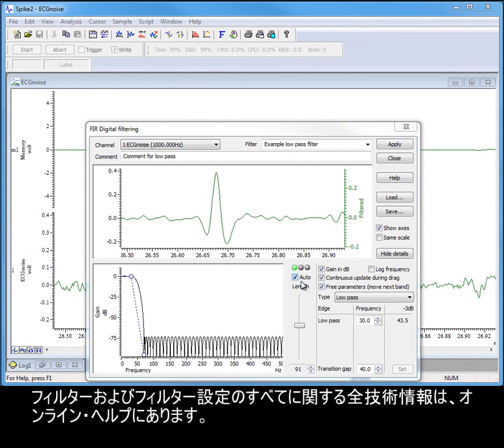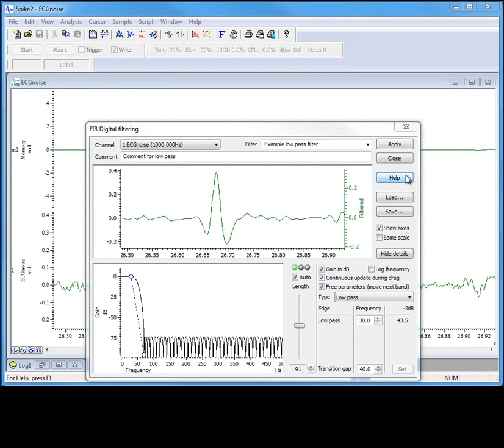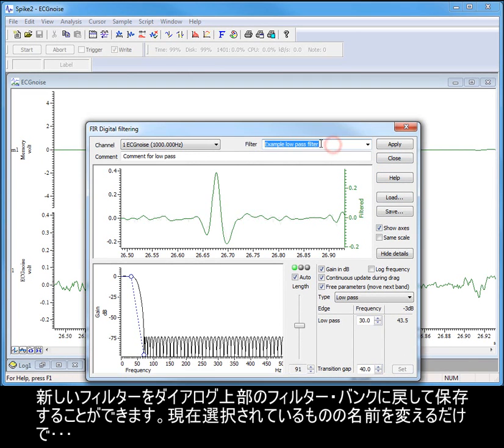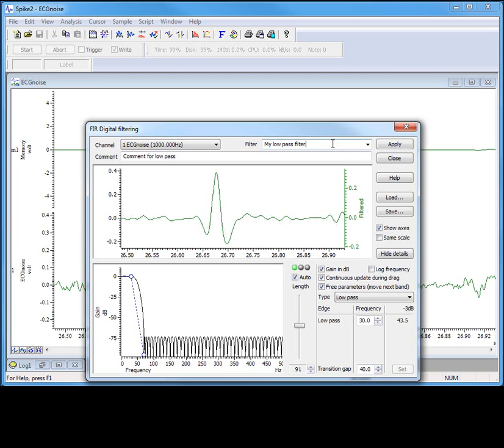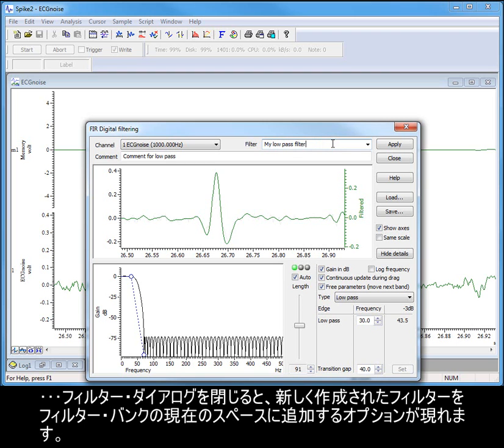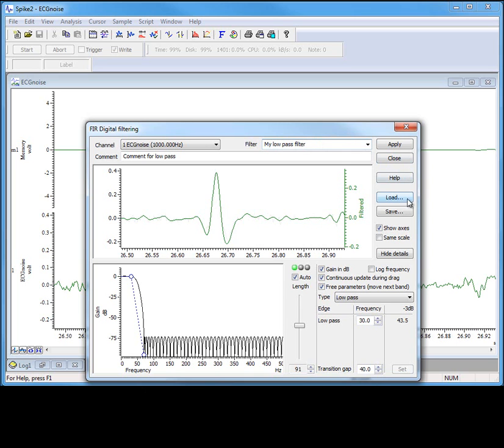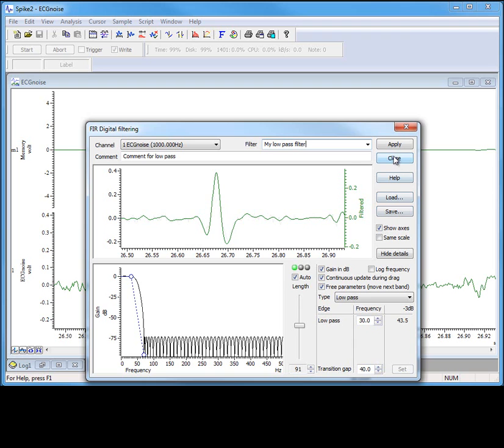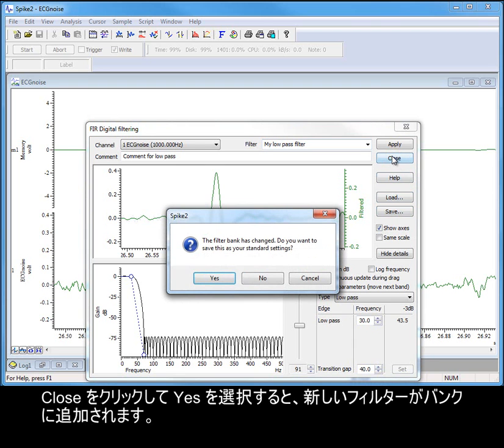Full technical details of the filters and all of their settings can be found in the online help. You can save your new filter back to the filter bank in the top of the dialog. Simply rename the current selection. And when we close the filter dialog, we will be given the option of adding our newly created filter to the current space in the filter bank. You can also load and save whole filter banks using the buttons in the dialog. Click Close and then select Yes to add your new filter to the bank.